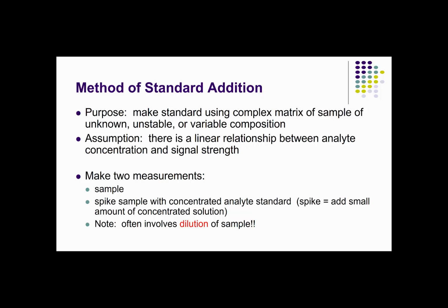The method of standard addition is a really important method. It's a method that I should underscore is not just for UV-vis. All you need to know in order to use it is that the signal is directly proportional to the analyte concentration. And it's a very quick and easy method to adopt. It works best when you're dealing with problems where you have a complex sample matrix, the components of which you might not necessarily know, either in terms of composition or concentration.